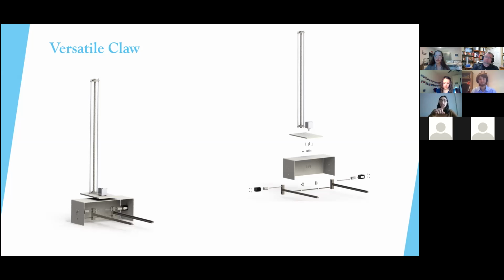And it's not shown, it's in the main assembly. There is going to be a stepper motor connected to that lead screw, and that's going to be on the XY axis on the top of the frame. And something that's a good, cool feature about this is that it can pick up well plates and it can pick up Petri dishes as well, if that's something that Modified may look into the feature and improving. So on to Daniel, he can talk about the fluid handling system.